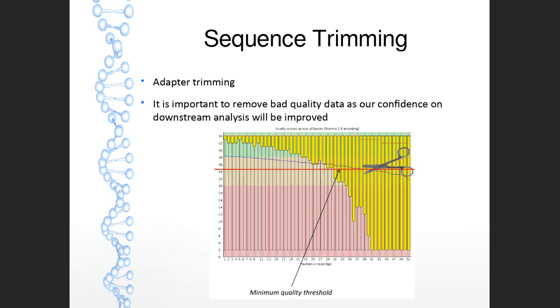Although we might decide to use 30, as that is a slightly more common threshold for good quality reads. So we can trim any poor quality base calls off the ends of our reads, meaning that we go from a collection of reads all of the same length to ones that have been trimmed to a variable length because we've taken any low quality bases off the end.